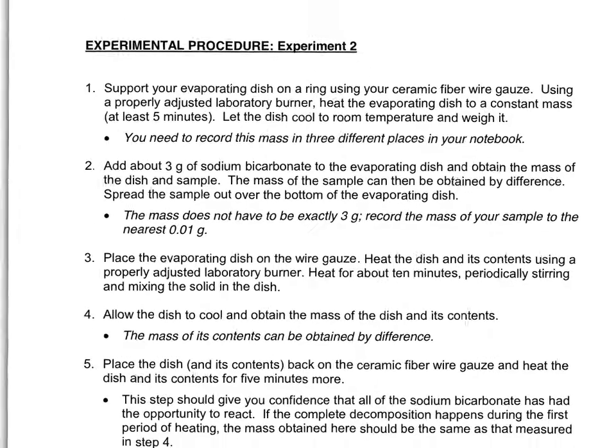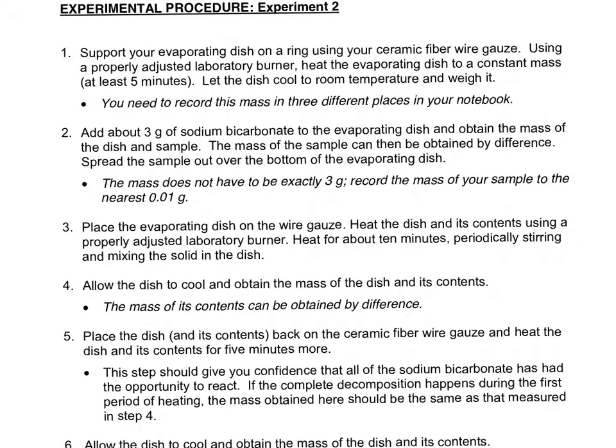So you always wanted to take baking soda and burn it, didn't you? I just know you did. Because step number 3, that's what you're going to do. You're going to heat it up. Notice we're going to use a technique to see if we are kind of heating to constant mass, in a sense. Step number 3 says 10 minutes. So you have some babysitting time.